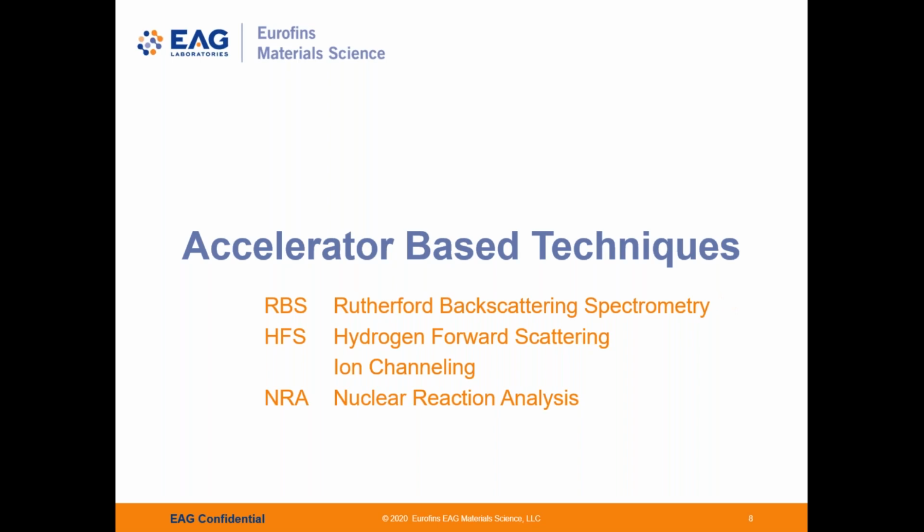The analytical techniques of RBS, HFS, channeling, and NRA are used in concert to provide the broadest view of a sample. Now, the ideal RBS sample has all the features of interest, isolated and background free. This is rarely possible in real films.